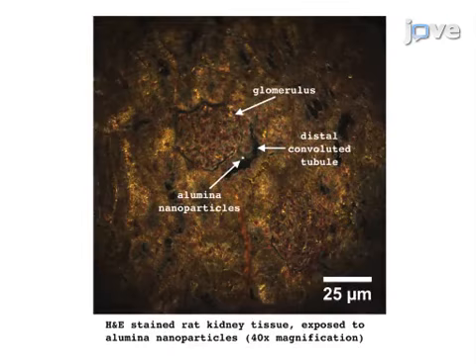Ultimately, enhanced darkfield microscopy and hyperspectral mapping are used to identify metal oxide nanoparticles in histological samples in a more rapid and less resource-intensive manner than other techniques such as electron microscopy. This method offers several advantages over conventional nanomaterial imaging and characterization techniques such as electron microscopy, in that sample preparation is typically minimal and non-destructive, image acquisition and analysis is less time and cost-intensive, and it can be applied for nanoparticle imaging in a variety of matrices.